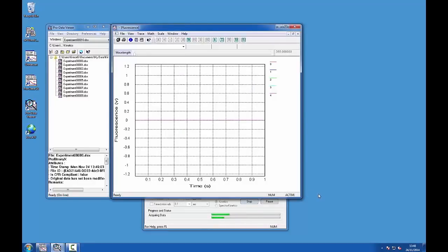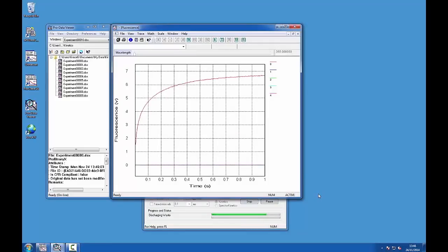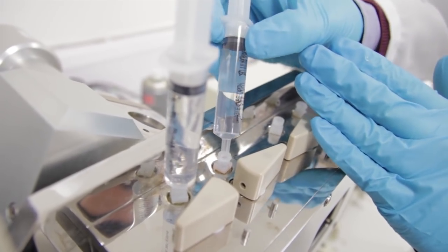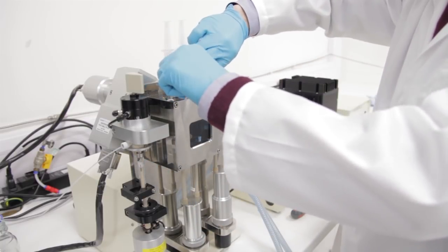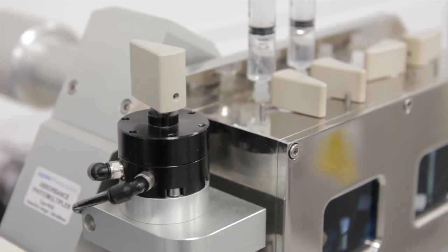Once you have completed your experiments, flush the system through with distilled water by filling the syringes, setting the drive valves to the drive position, and clicking drive several times. The system can then be left indefinitely with distilled water in the flow circuitry.